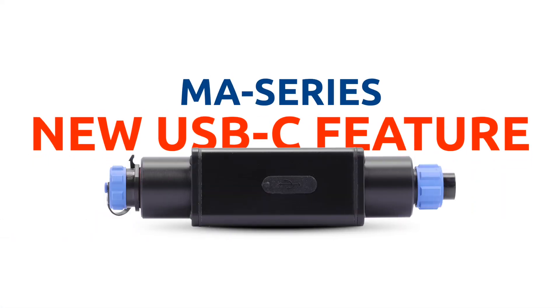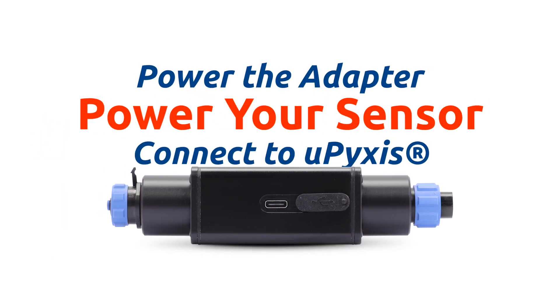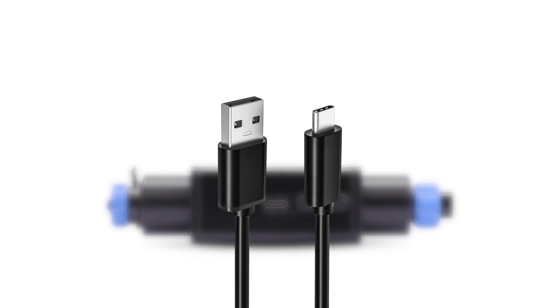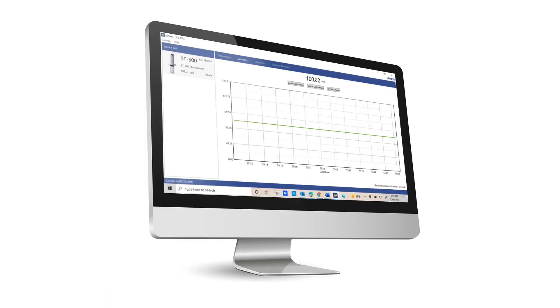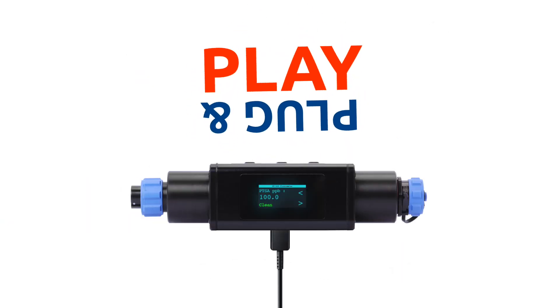Our MA Series Bluetooth adapters are getting a quick USB-C feature upgrade. Power your adapter and connected sensors for quick uPyxis access using a USB Type-C cable. Power can be supplied via a wall outlet or a personal device like your laptop or desktop computer. Simply plug a USB-C cable into the bottom of the MA Series adapter and immediately power your adapter and any sensor you have connected.